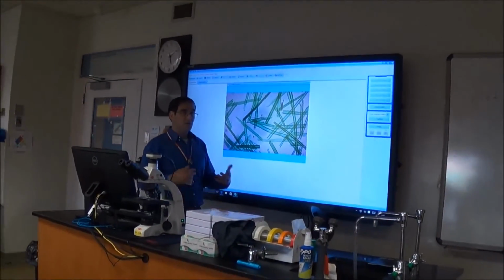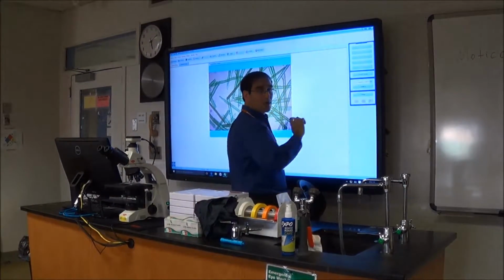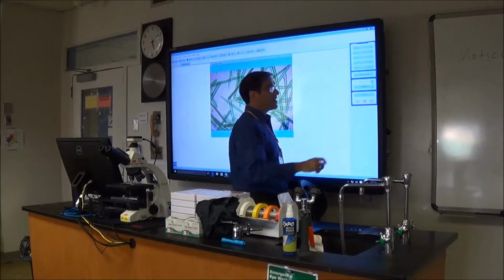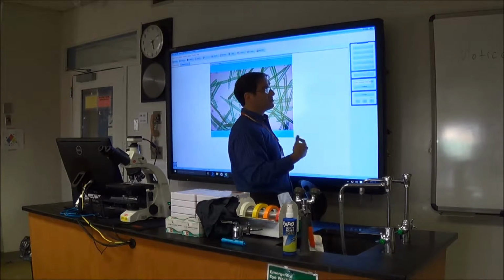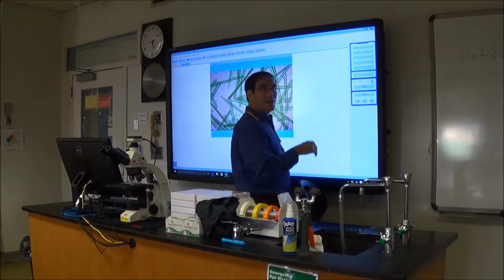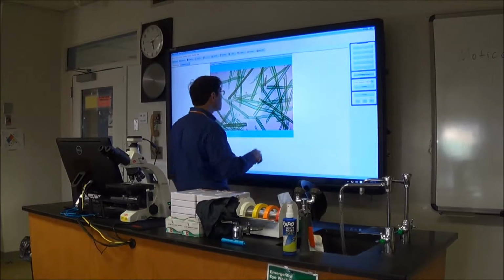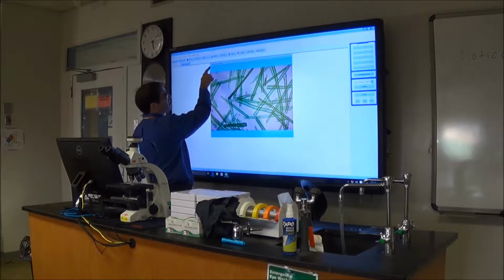All right, so that's if I wanted to do it with students' images. Well, what about instructor images? Let's cancel out of Teacher Demo. So yet again, if you want to return control of the tablets to them, press Cancel Demo. It's the same button. It's going to count down 5, 4, 3, 2, 1, and now it's done. So let's get out of this. Remember, double tap on the title bar. So in this case, microscope 005.